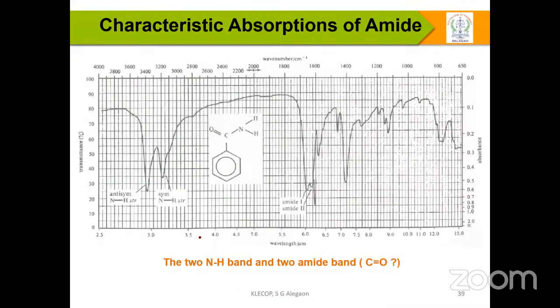Look at this amide. Just as I discussed in the previous time for amine, look at this. Here one of the important C double bond O character is missing. Instead of C double bond O carbonyl stretch, we are discussing amide 1 and amide 2. Most of the time, those who are working on big molecules like proteins and peptides, and the person working in carbohydrate chemistry, come across this problem.